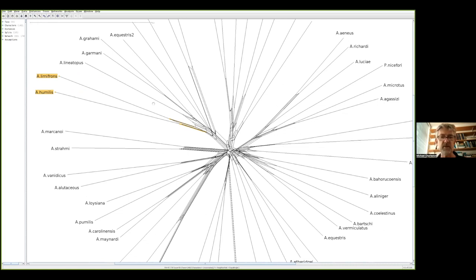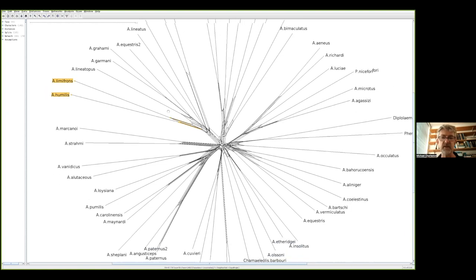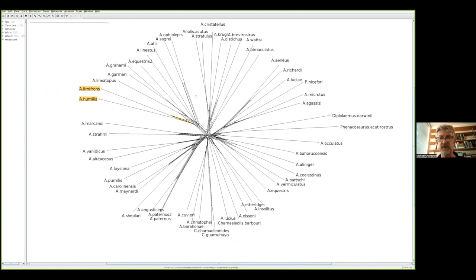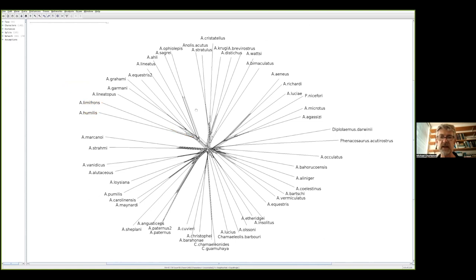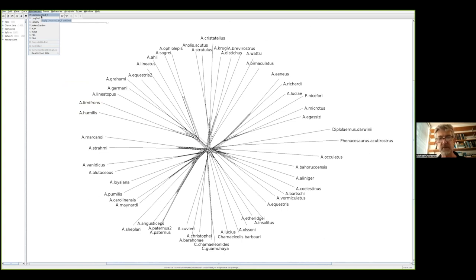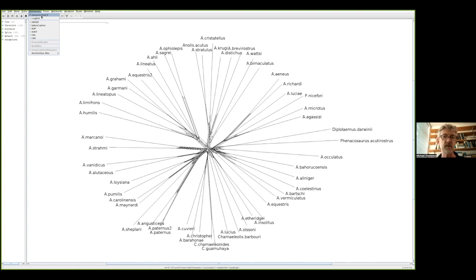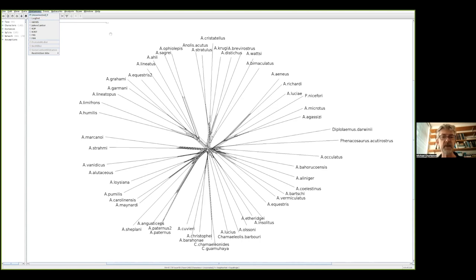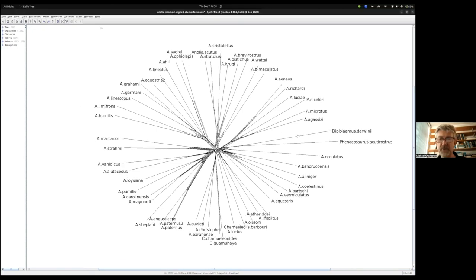This brings me to the different models. This is the default distance measure that is used when you load up an alignment in SplitsTree. If you go to the distances menu, you can see this is highlighted as the uncorrected P distance. Uncorrected P just means the proportion of sites that differ between any two sequences. It's got no sense of a molecular model of any complexity. It's just P for proportion, a value between zero and one.